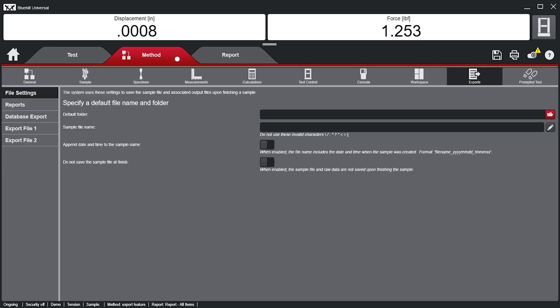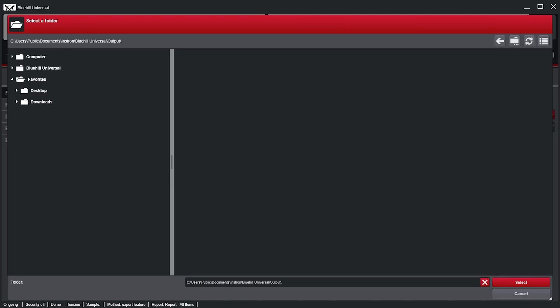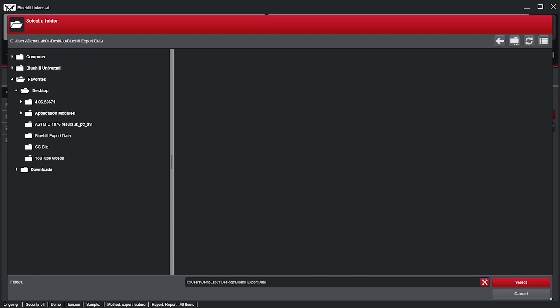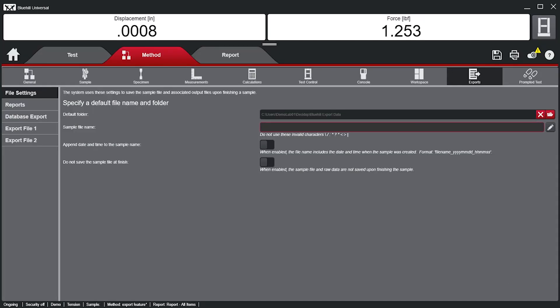By going into the Method tab under Exports, users can configure the export settings for reports and general data export. Under the File Settings section, users also have the ability to set a default folder. The selected default folder can be saved within individual methods, and this is where all export information will always be saved. Users can specify a name for the sample file, as well as choose to append the sample file with a date and time stamp.